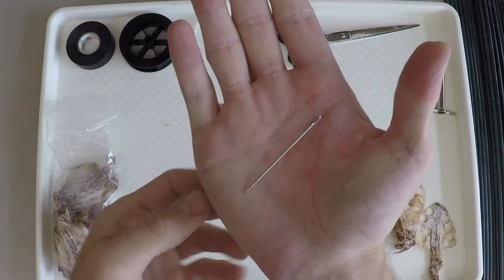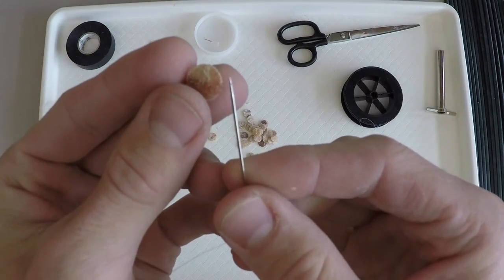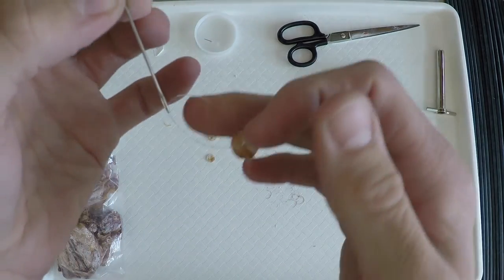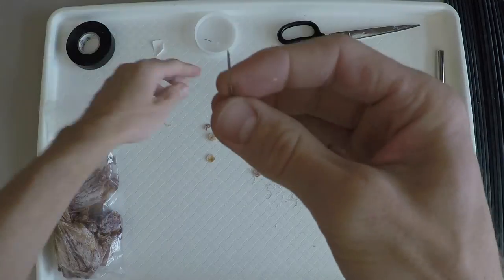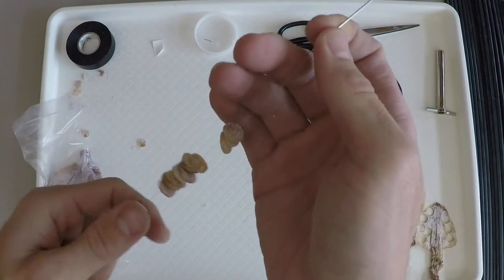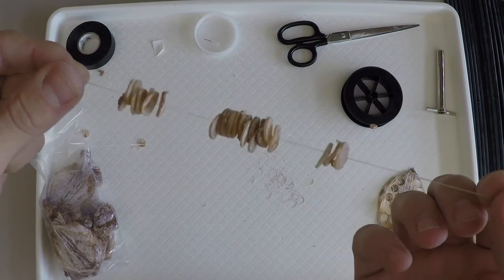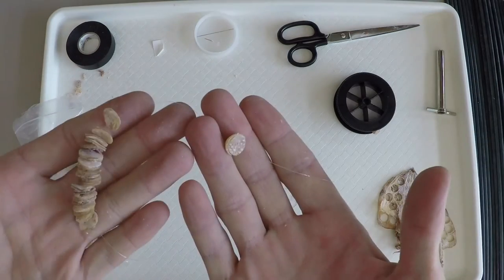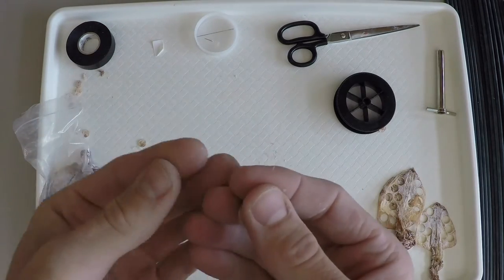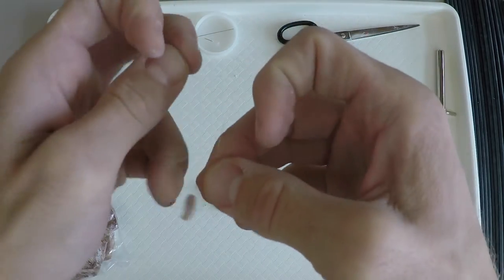Next, string the 25 squid pieces onto your fishing line. It's best to puncture the squid slightly off-center from the middle. If you don't have a sewing needle, you can also poke a hole through the squid with a tack and thread the line through by hand. This results in a necklace of squid pieces. You will now tie off the squid pieces one at a time and cut them from the line. Pull one piece toward the end and use a fishing hook knot with 10 twists or similar knot to secure the piece on the line.